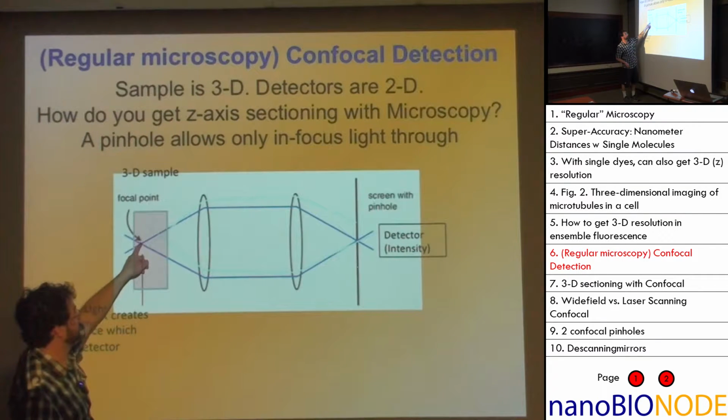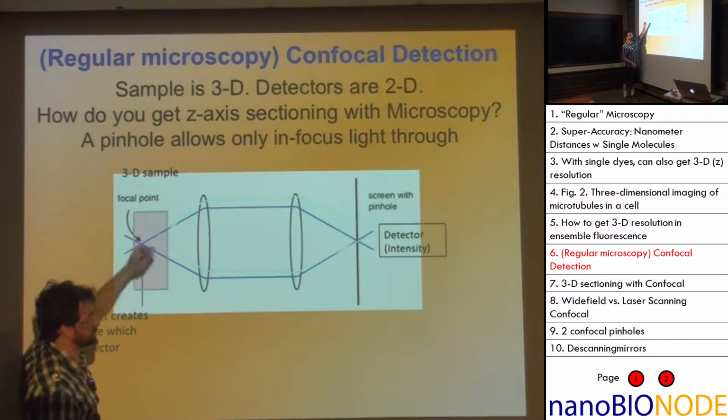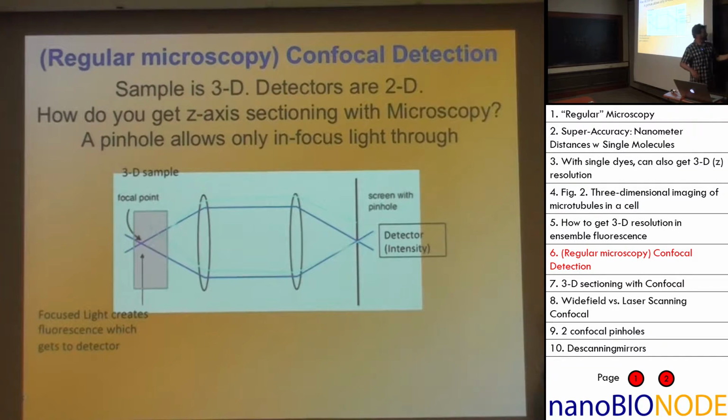And now what about the Z-axis? Let's say you have another arrow over here. Where will this focus? Well, it'll either focus right there or a little bit farther. If I was careful enough, we could figure out which it is.